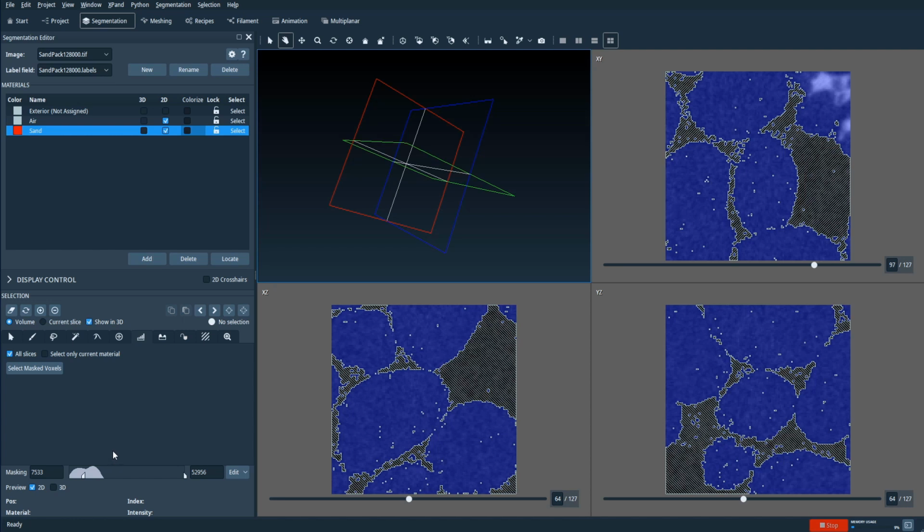other tools in Avizo, is that you see this sort of this tool here where we can specify the minimum and maximum values. Right behind it, you can see a sort of grayscale plot, and this is actually the histogram of our data set. Okay, so the histogram roughly tells you how many pixels or voxels in the data has a certain intensity value.